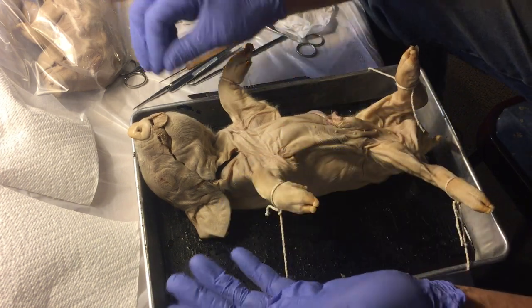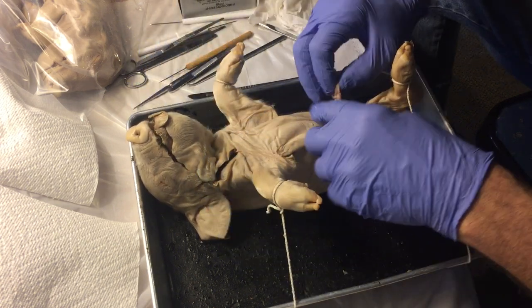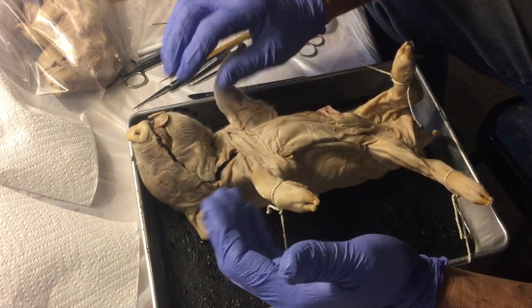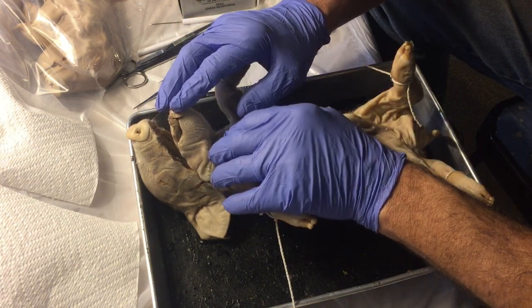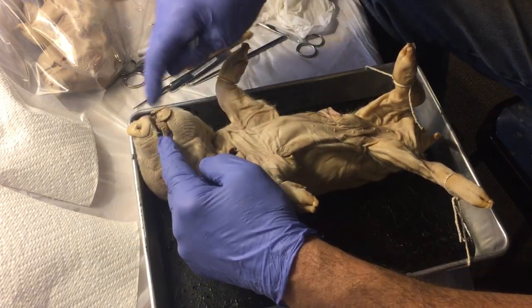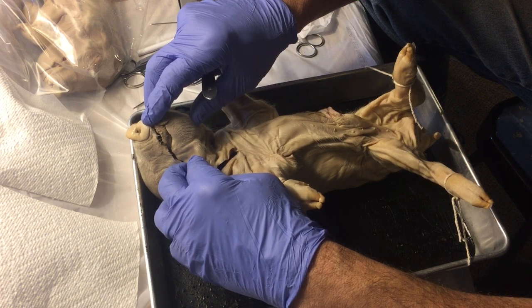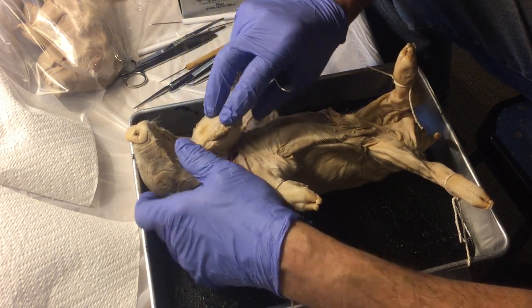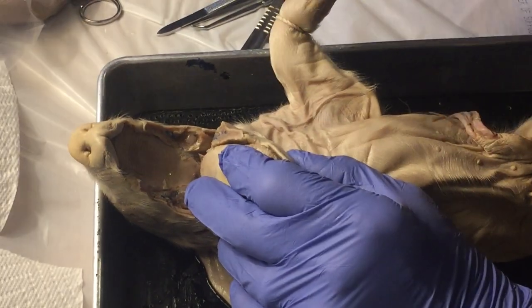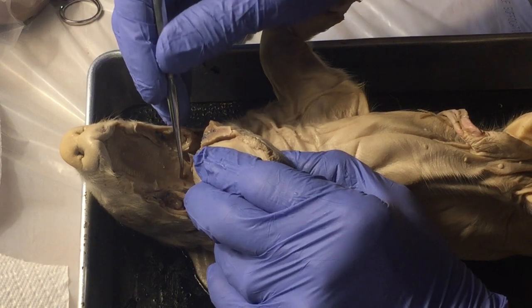If we look at this pig externally first — the tongue, fairly sizable thing, taste buds sticking out there. Here we have the umbilical cord. We're going to start off by looking at the mouth. I've already cut down the corner of the mouth on both sides, cutting through the TMJ joint — the temporal mandibular joint — the joint that allows the mouth to open, and it's going to open unusually far. Inside the oral cavity you can see the hard palate, that's the roof of your mouth, and behind that is the soft palate.